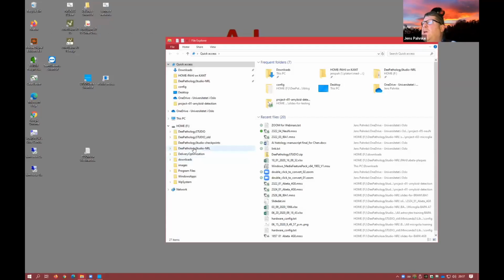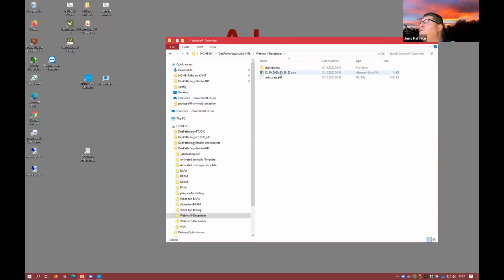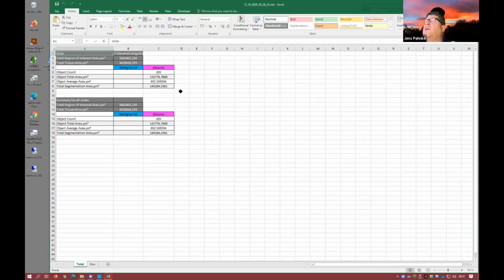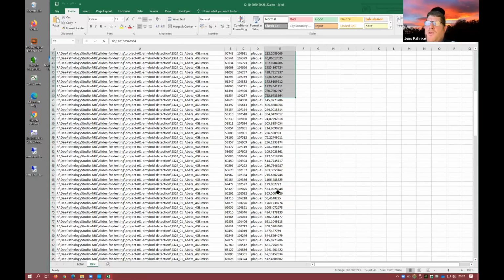Just for this now, I would like to show you how it looks like with the results. So you can go into, we call this webinar 1. Here is the Excel sheet. 2028 is our time here in Oslo. And let's have a look. So that's how it looks like. Here we have now a single sheet where we only get the amount. We can also segregate it in small. So we have the objects, 205 objects, the area, object, and so on. And then we have the raw information for each of the objects. For example, the area here. So this is what we now wanted to have.